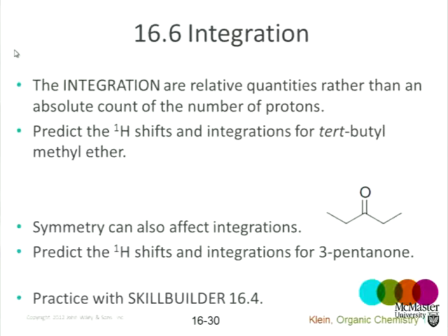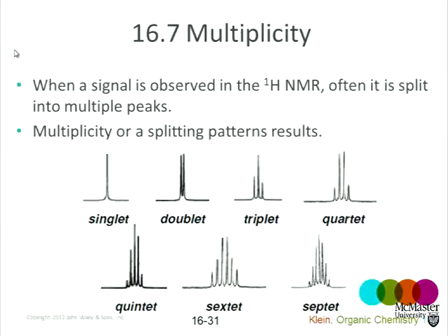So there's a couple of little exercises there, which leaves us then at the really exciting and mind-boggling question of coupling. And so this is altogether a much more challenging thing to understand, because now coupling is telling us about the number of neighbors in a group. But it's critical to solving structures, because we can get the pieces, we can get the methylenes and the methyls, but we need to know what order to join them together in. And we'll pick up there.